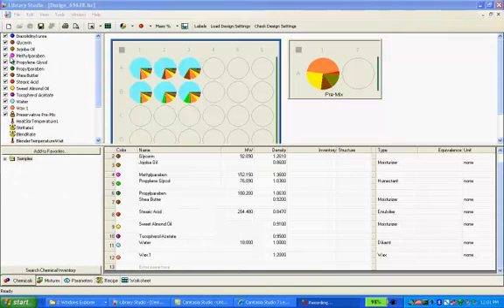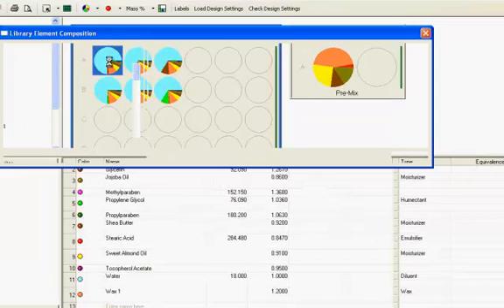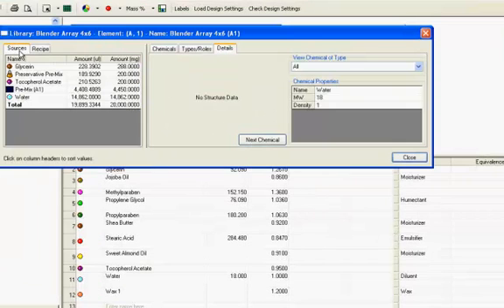This is the testing of Camtasia Studio 7 and its application in the creation of a Library Studio demo. As an example, I am going to click on well number A1 and go into the Sources tab. Here I see a number of chemicals that have been used in creating a sample in that well.